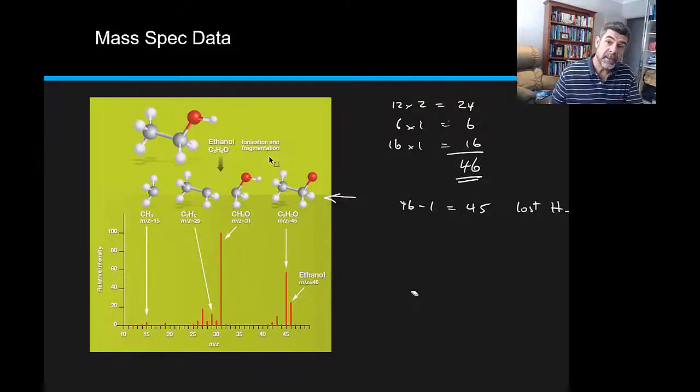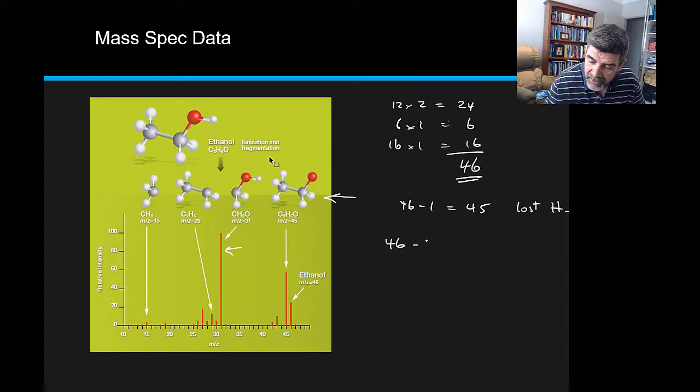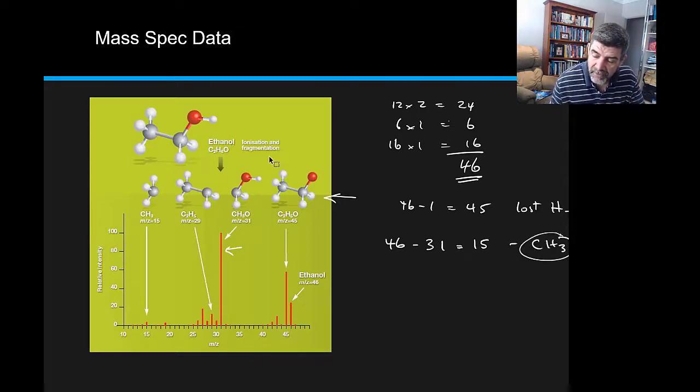So the next big peak we see is this peak at 31. So let's take our molecule and subtract 31 and what we get is 15. Now you might remember from the previous slide, 15 is what we get from a methyl group, a CH3 group. So that indicates that somewhere along this fragment we've had a CH3 group break off it.